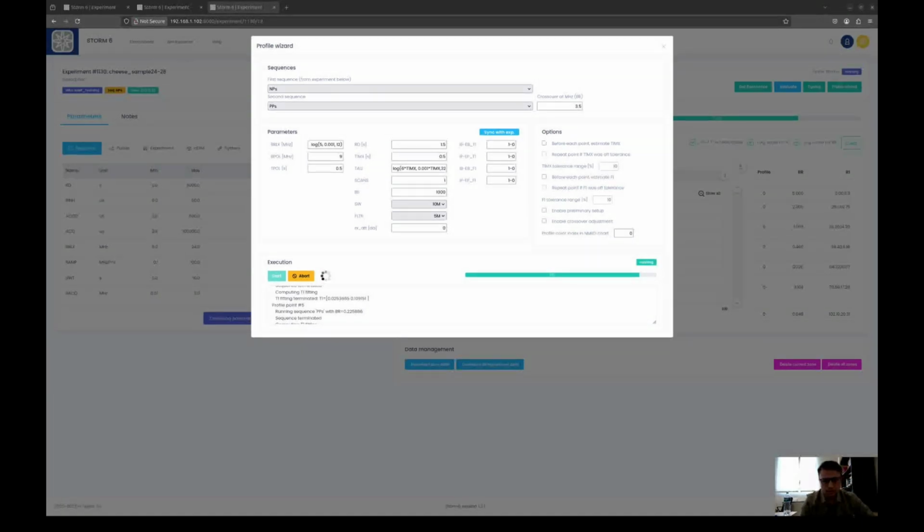As we can see here, the NMR profile is about to end, and cheese has a really heterogeneous nature. Due to this heterogeneous nature, it has water, fat, protein, and based on the age of the cheese, the relaxation values, this curve, the components give different kinds of profile values.